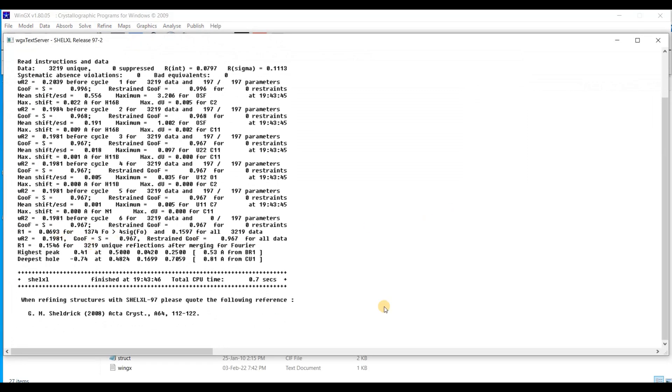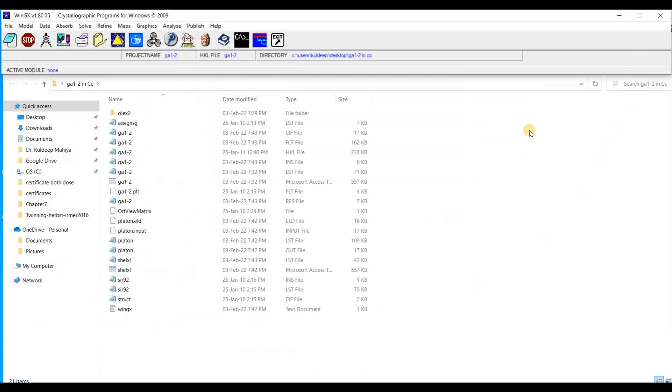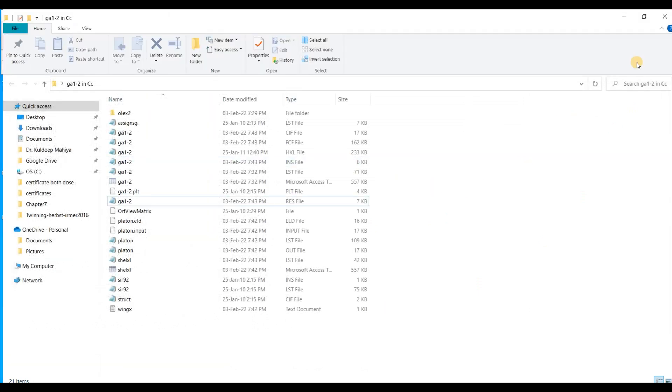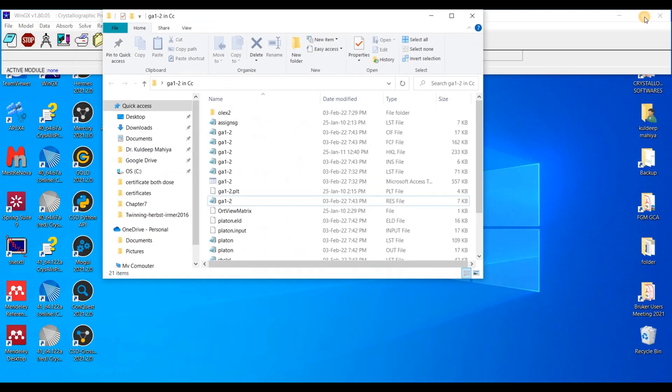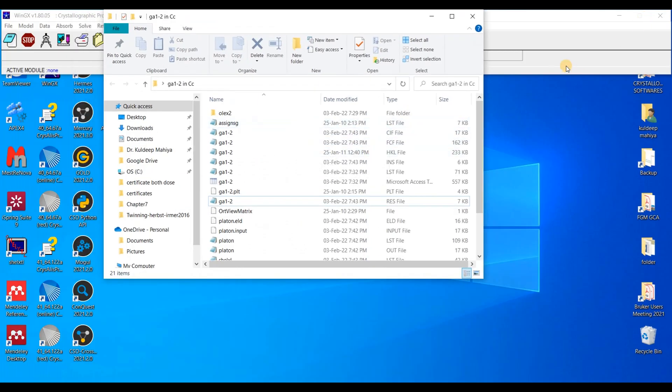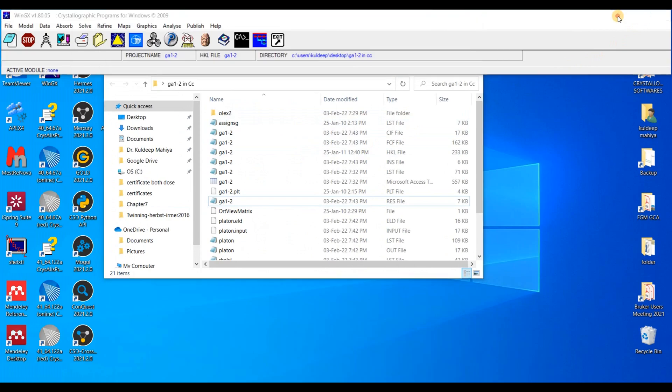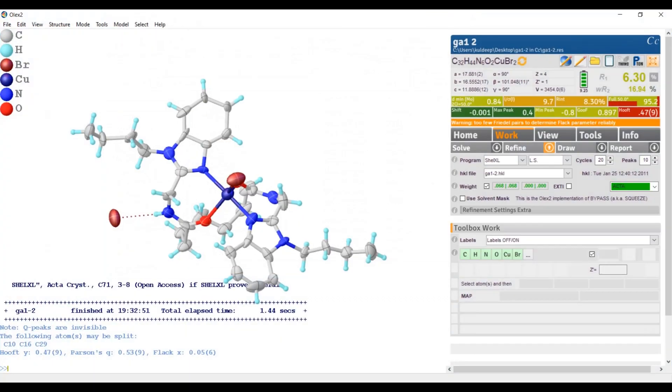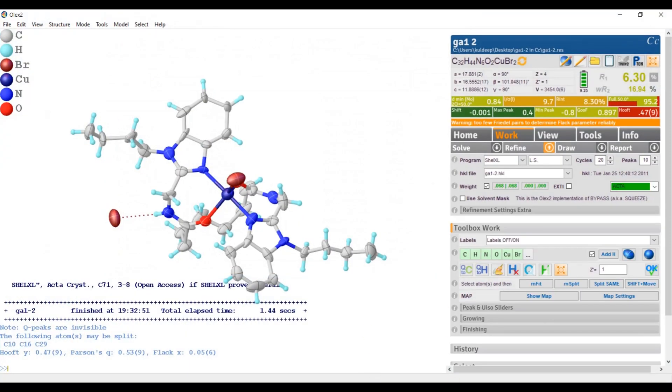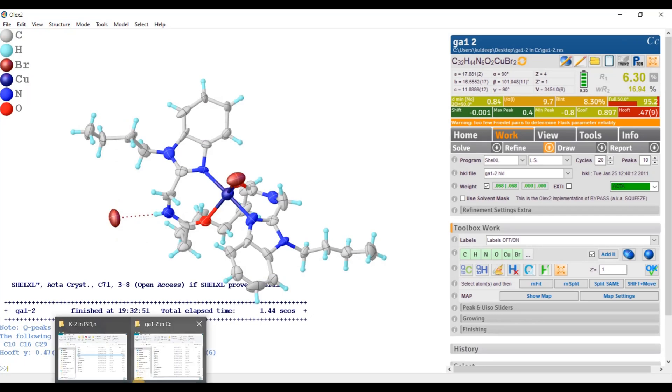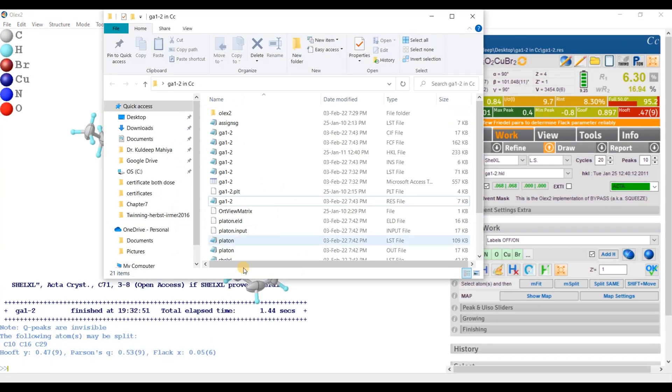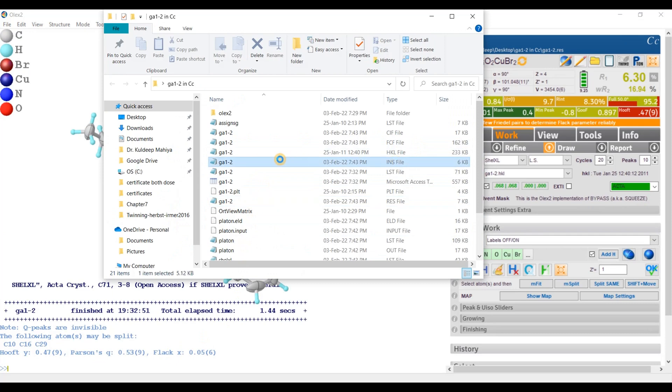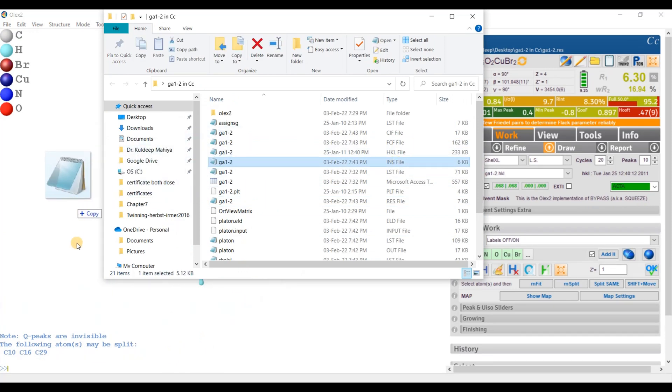Good. Now I am going to close it and minimize this. I am going to again open the Olex2 and the new file, this one. And I am going to open. Okay.